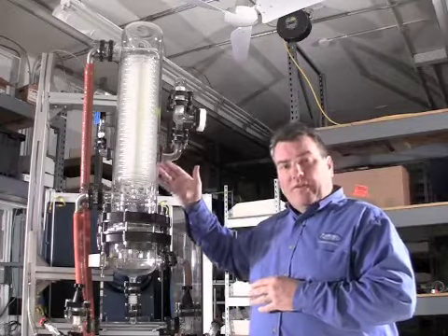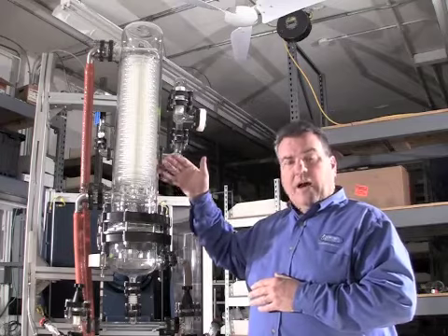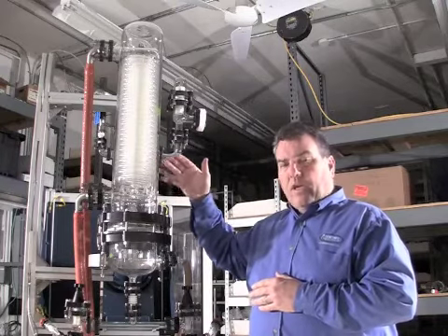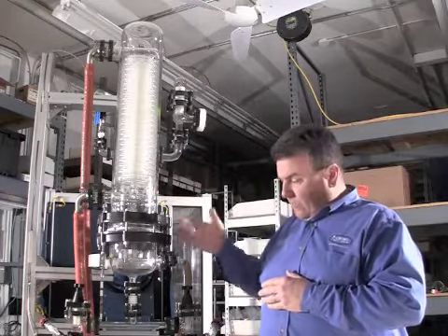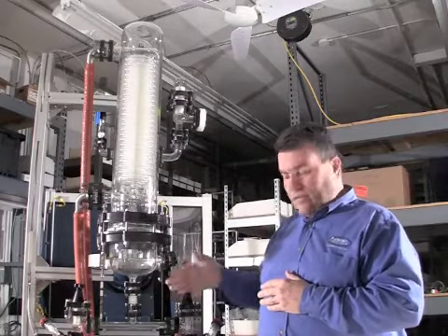One of the main components of the condensing system is this high efficiency, high heat transfer area coil condensing unit. The coil condenser takes the vapors, condenses them to a liquid, and then sends them onward via gravity to the receiver vessels.